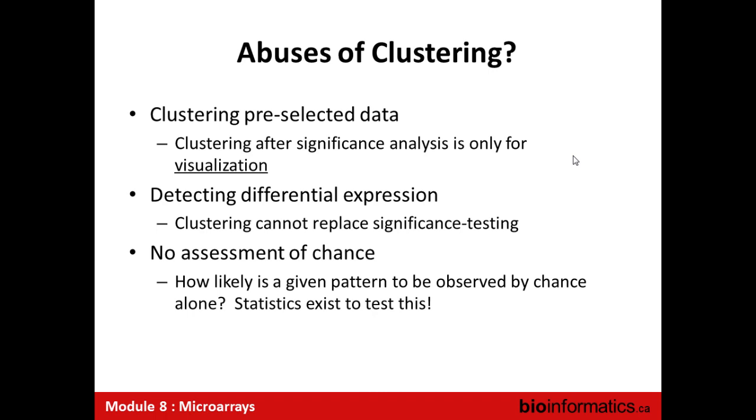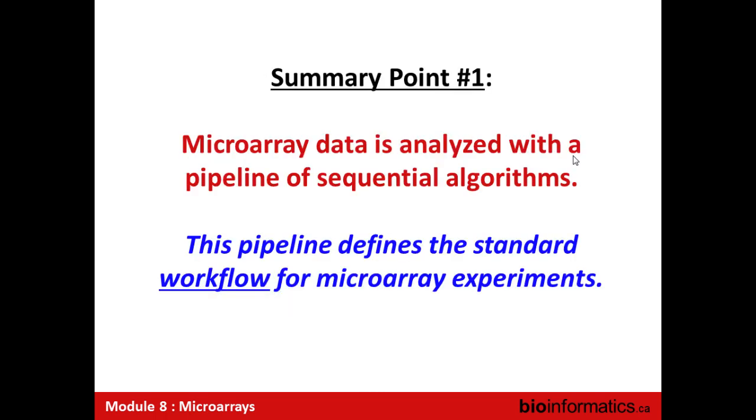Similarly, if I think that my technicians show different effects that cluster together, there are lots of metrics that will allow me to assess whether my technicians show non-biased clustering patterns. But if you don't apply them and you just look at the data and go, oh, that looks non-random to me, that's not particularly meaningful. So a good clustering should also be associated with statistical evidence to support what you think you're claiming from it.